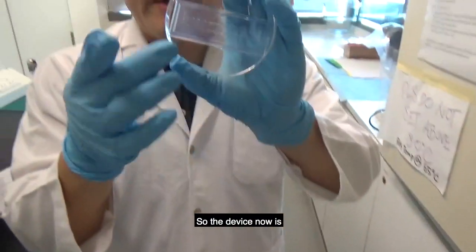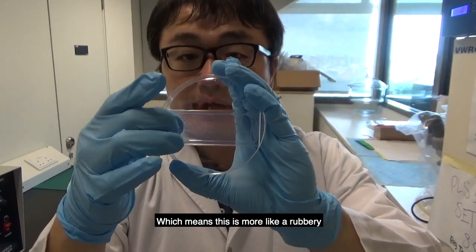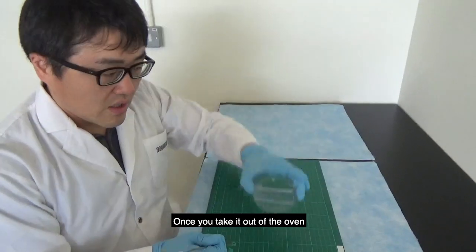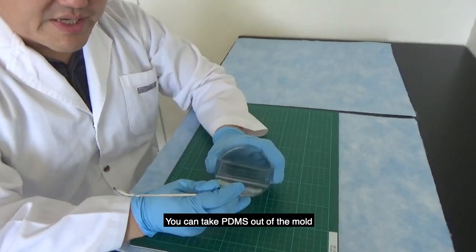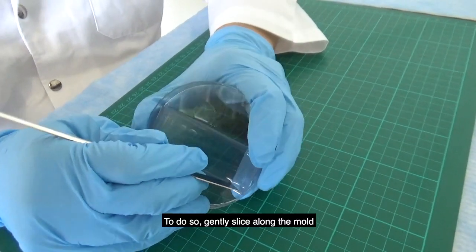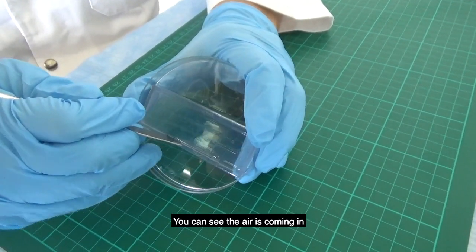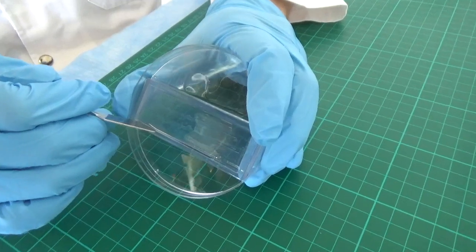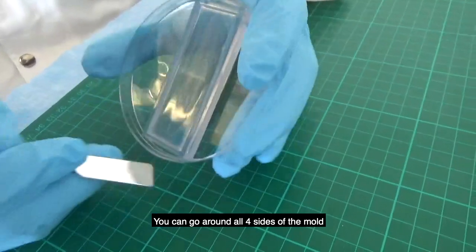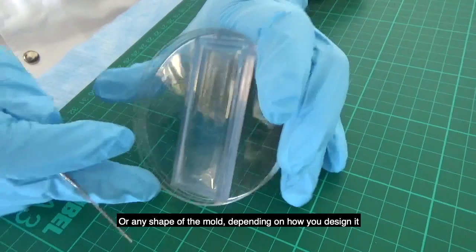The PDMS is now cured — it's rubbery and no longer liquid. Once you take it out of the oven, you can remove the PDMS from the mold. To do so, gently slide a spatula in — you can see air coming in — and go around all four sides of the mold, or whatever shape you have depending on how you designed it.